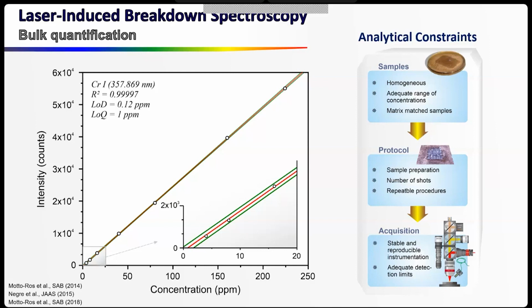in fused beads like lithium tetraborate beads. And then we had to develop a fantastic instrumentation, very complex, very stable, and so on. We found a good protocol, and 3 years after, we got these results. With these results, I went to analytical laboratories and said, hey, look guys, we are very quantitative, this is fantastic. You have to buy LIBS, give me some money, I will give you a fantastic LIBS.